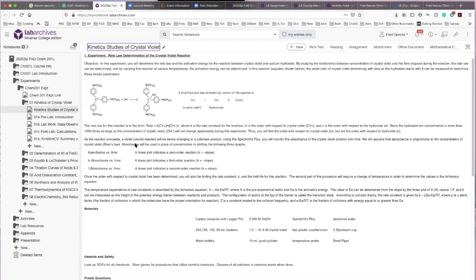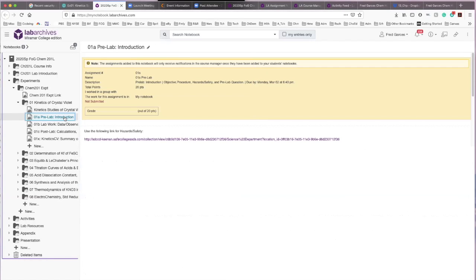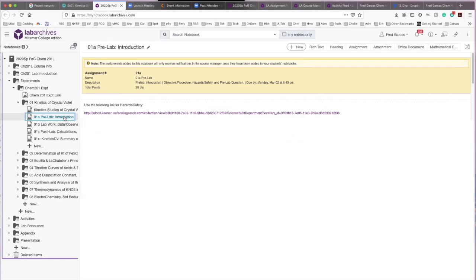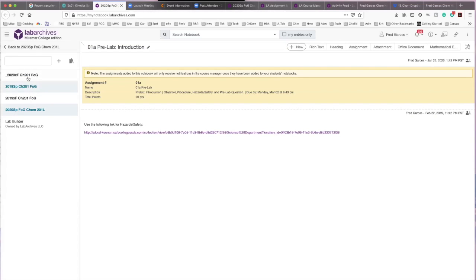And then you don't have to go back to LabArchives. You can just go to the pre-lab. And when you click the pre-lab, this is what you will see. You will see the description, the title, and then it'll tell you the date, this is not March 2nd, of course. I gotta change that. Let me just make sure I have the right notebook. Yeah, this is the wrong notebook. You see how it says spring 2020? That's the wrong notebook. I have to go to fall.